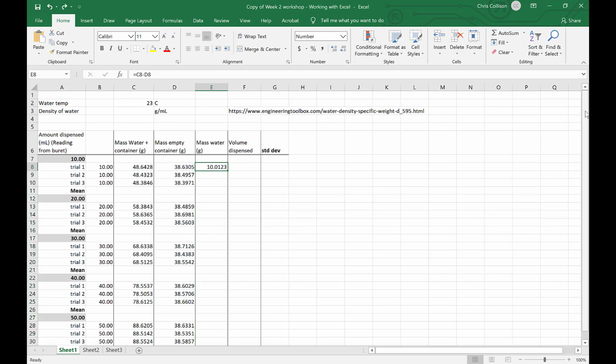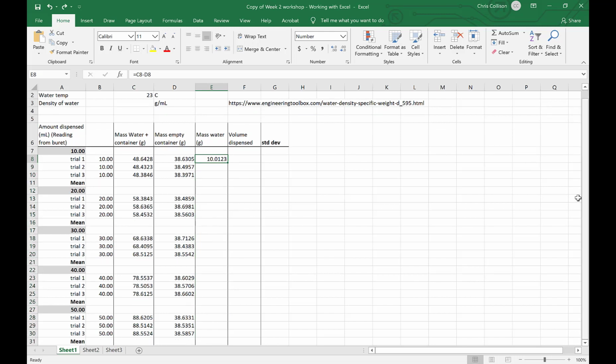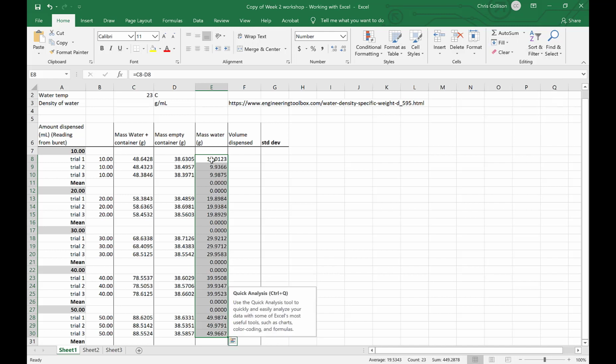Another approach I can do is simply move down to the bottom of the cells that I'm interested in. If I have a really long column of data in here, I can press Shift and click on the cell at the bottom of this group. I'm also going to use an approach which is called Fill. So I can fill down from the menu options. Another thing I can do is use a short key option, which would be Control D, and I'll show you the effect. I'm going to press Control D, and that fills down automatically.